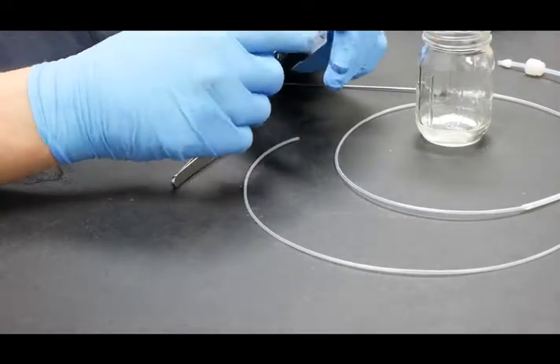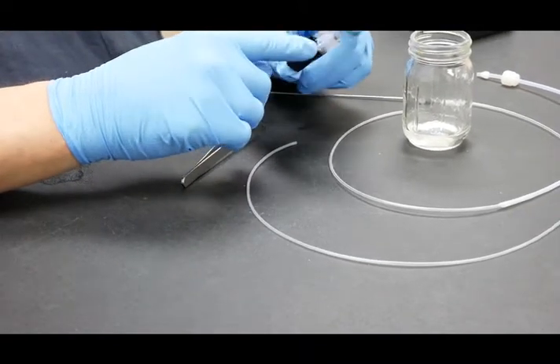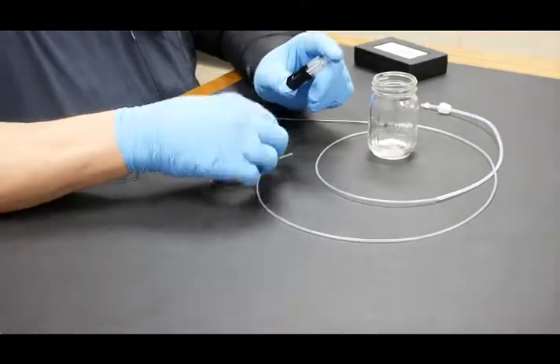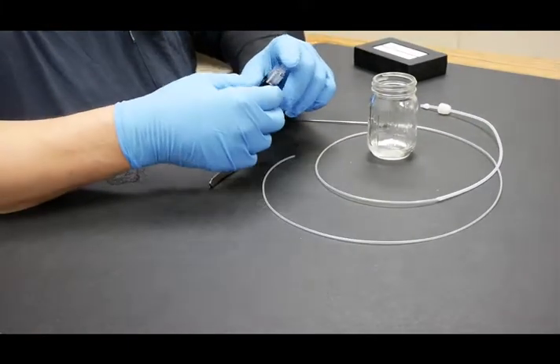Once we do that, we want to identify the stem tube that connects to the bottom of the flow cell. That's going to be the one that the probe tube attaches to, the long one.